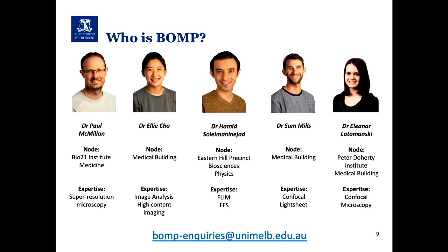Hamid looks after Eastern Hill Precinct, Biosciences, and a new node which is about to come on, which is the School of Physics. His background, he's got a PhD in fluorescence lifetime imaging and is also skilled in fluorescence fluctuation spectroscopy. A lot of these high-end techniques I'll discuss in the applications section.